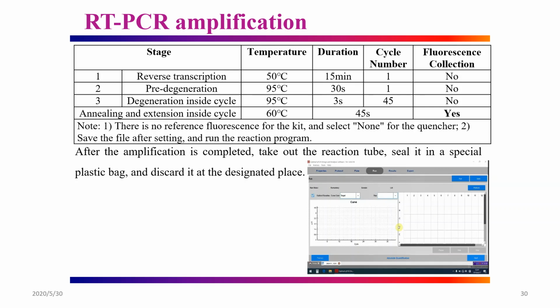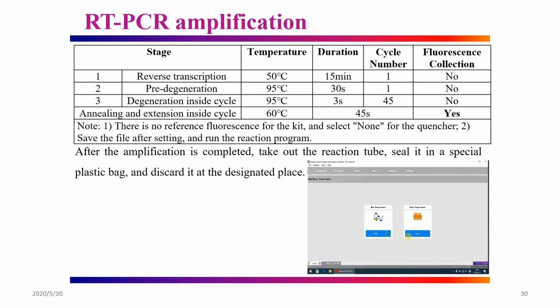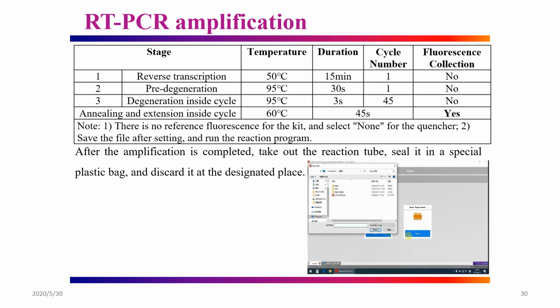When the program starts to run, the running page will display the estimated remaining time, and the graph of the amplification curve will be displayed as below. We can also open another data file for analysis when another program is running in real time.